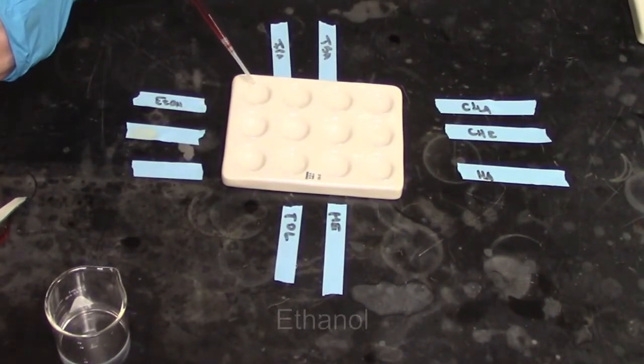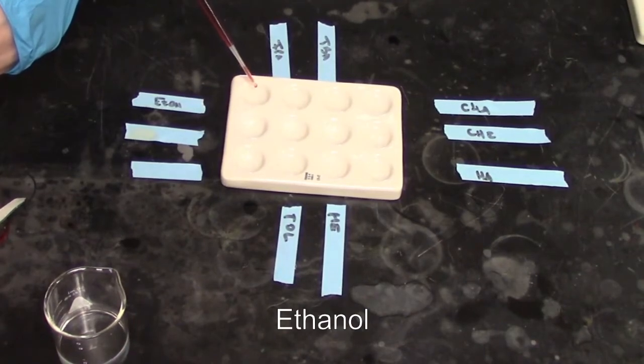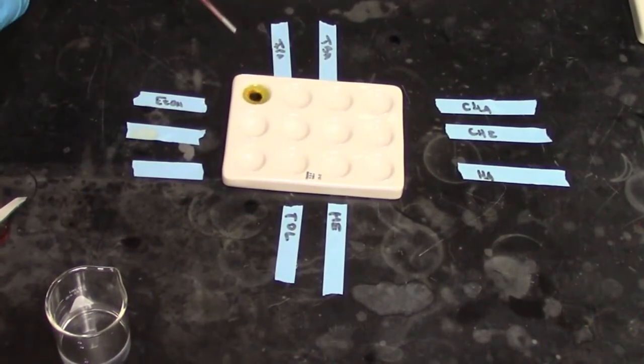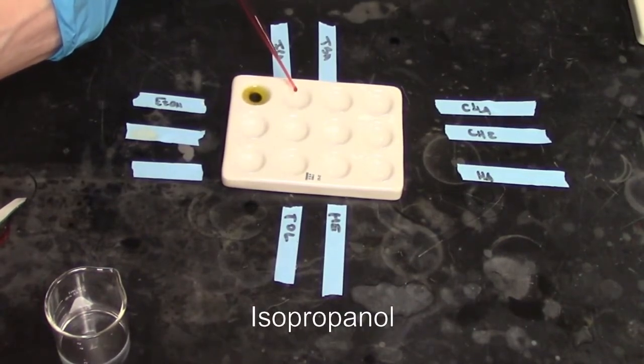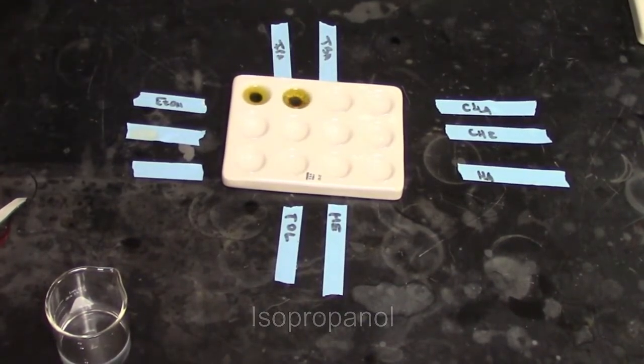So if we look at ethanol, doesn't take much. We add a drop and we see the shift to a green color from the orange. Isopropanol, same shift.